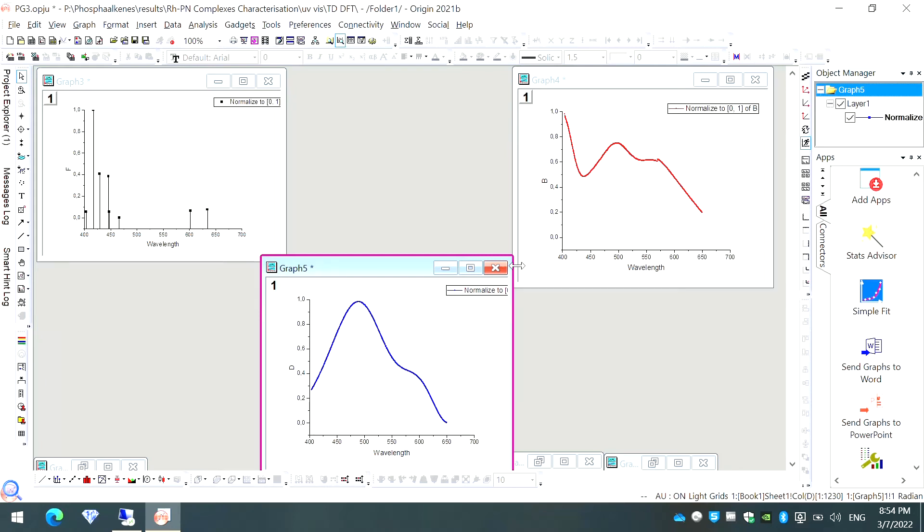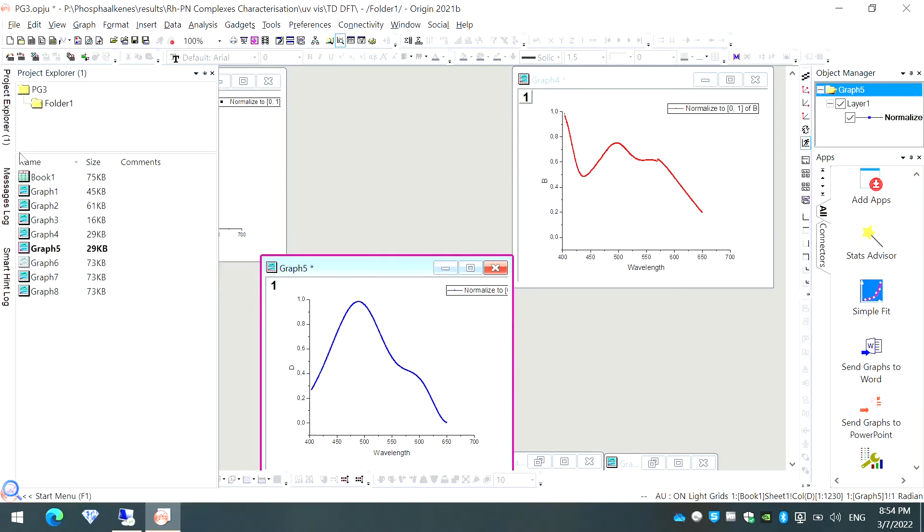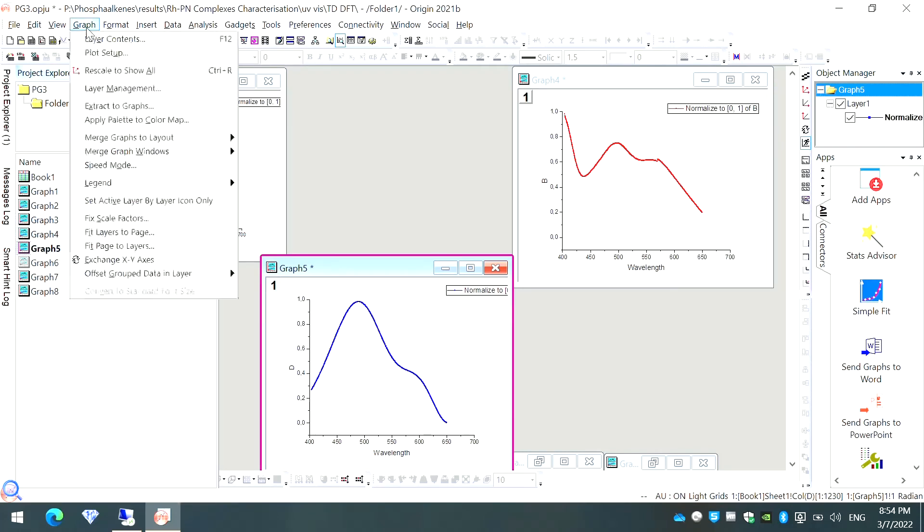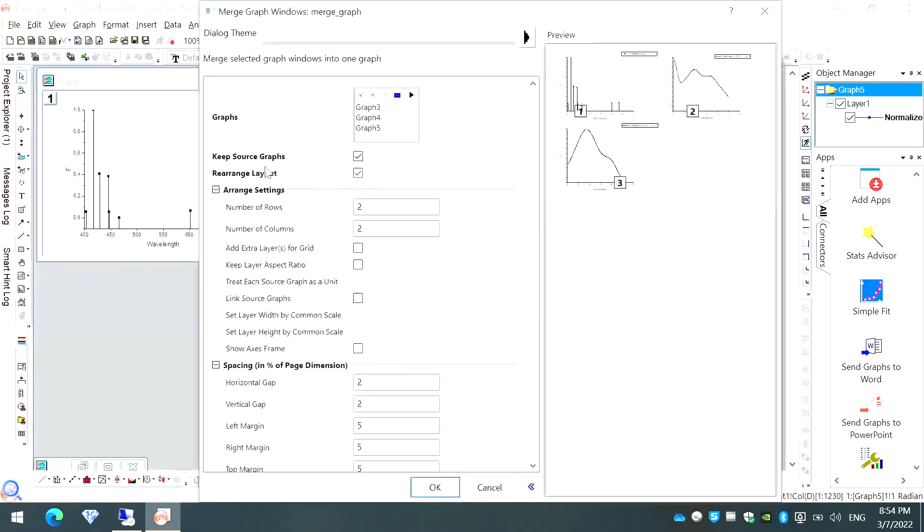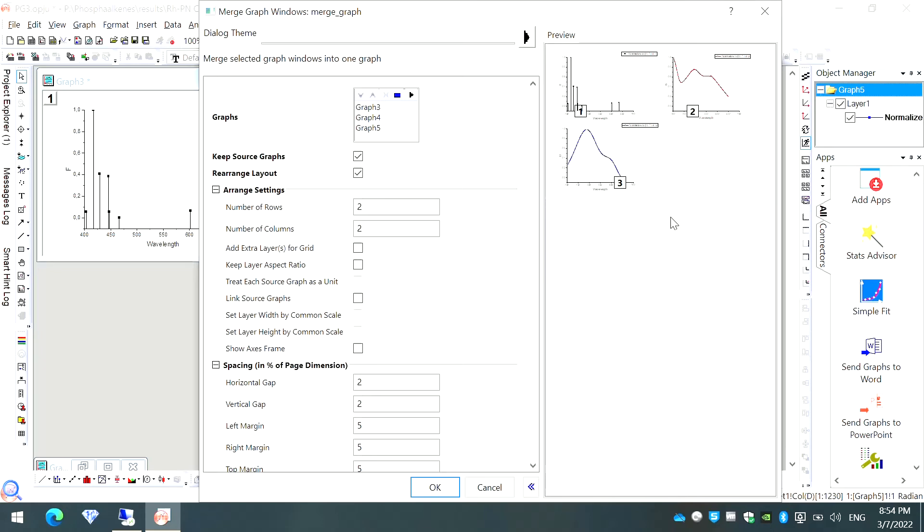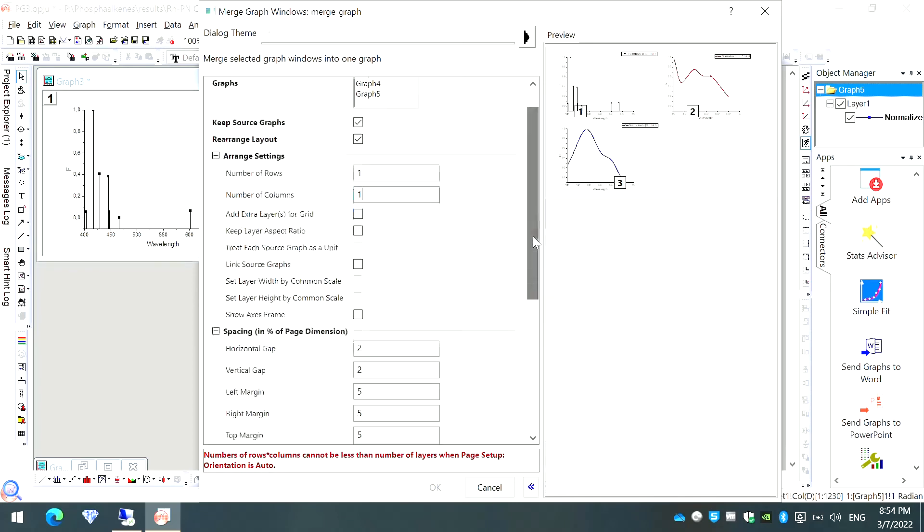Once I have made the scale of all my graphs same, now I can easily merge these graphs in one single plot. To do this again, I will select all these graphs, graph number 3, 4, and 5. Then I will go to this option called Graph and then Merge Graph Windows and then Open Dialog. If you want to export them separately in one sheet, you can just click on OK and export it as an image. But as I told you, this is not very impressive. For a comparative study, usually we want that all these graphs should be plotted in one single graph. For that, you have to change the number of rows to one and number of columns also to one.